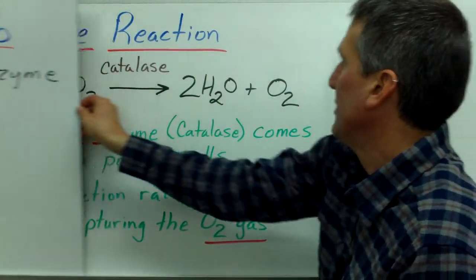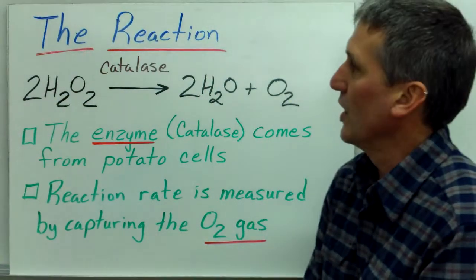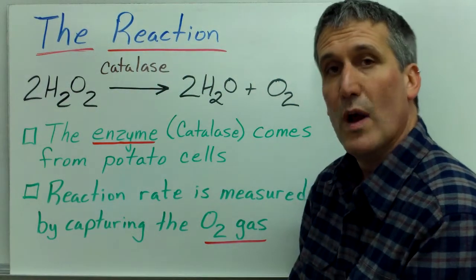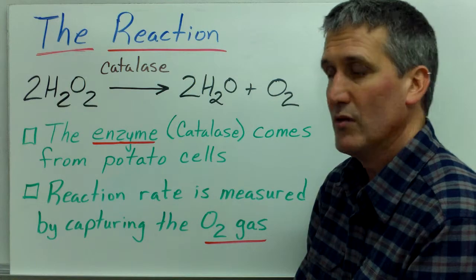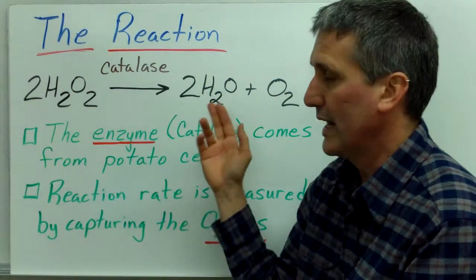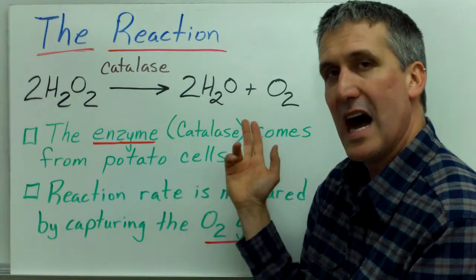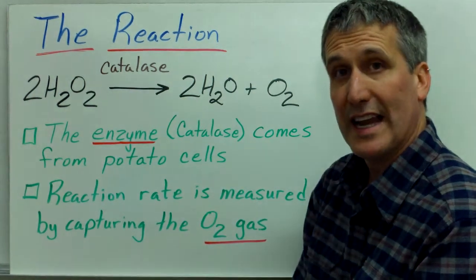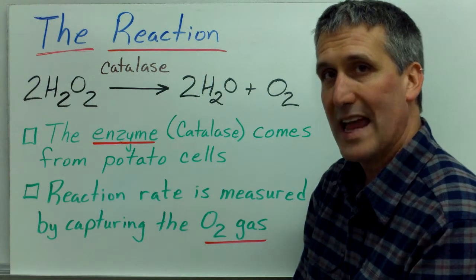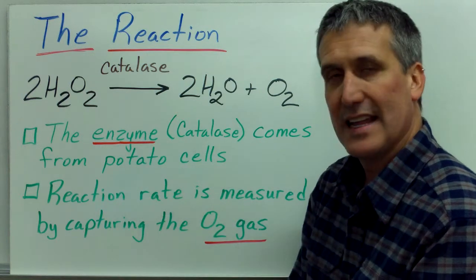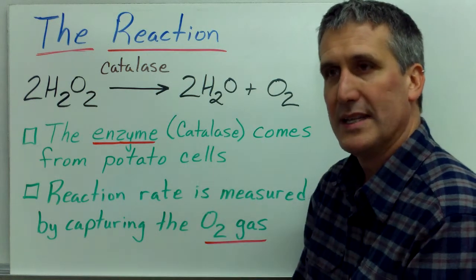In this lab, we're going to look at the following reaction. It's actually the same reaction that we looked at when we did the catalyst demo. We're starting with hydrogen peroxide, and it's going to be broken into water and oxygen gas. In this case, we're not using an inorganic catalyst. We are using an actual enzyme, and that enzyme is called catalase.